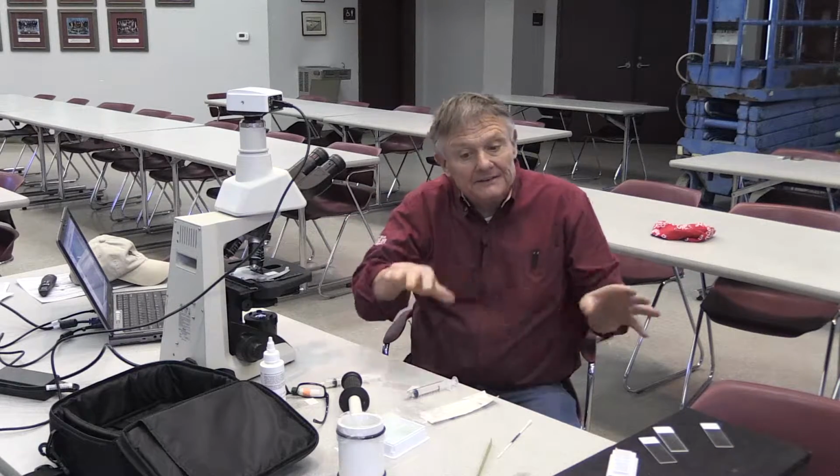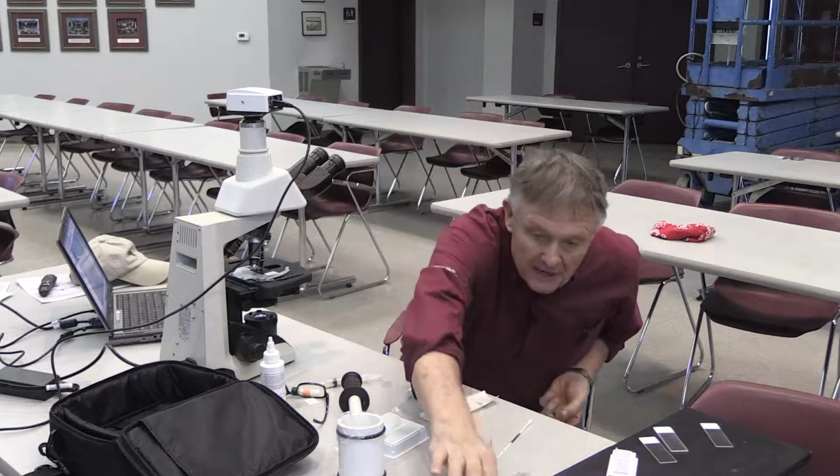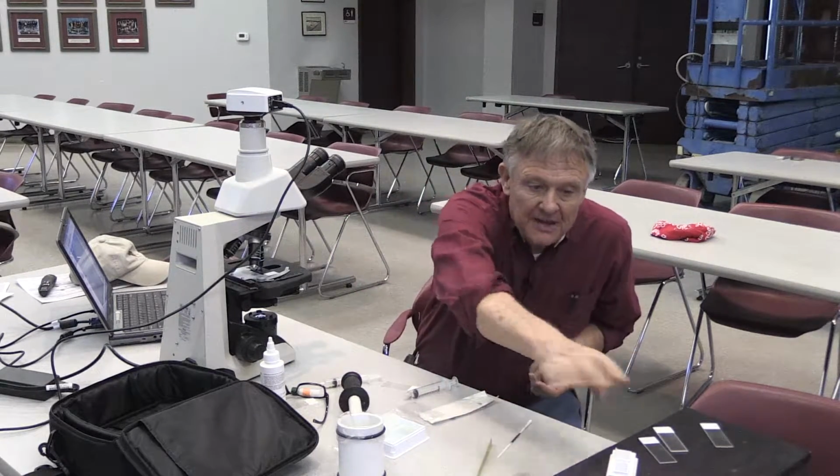So I want to make sure that I keep everything at an even, warm temperature, about body temperature. Again, what we have is a slide warming stage right here. We can set the temperature on this stage to keep all of our slides warm. Now in the field, occasionally I've used heating pads, anything to keep those slides warm. You want them at about body temperature.